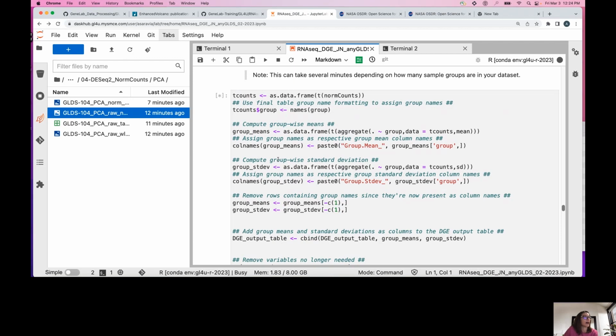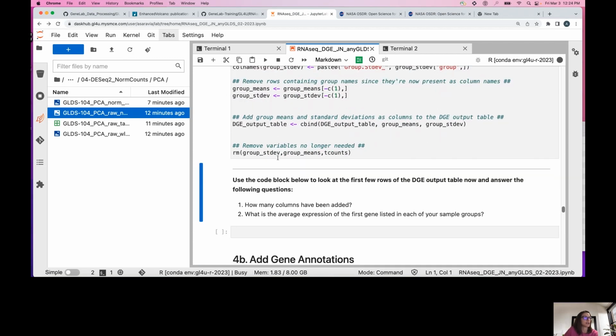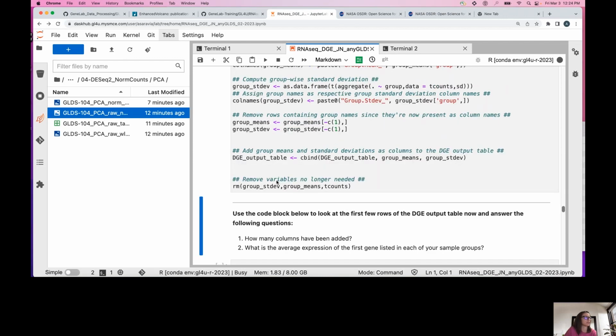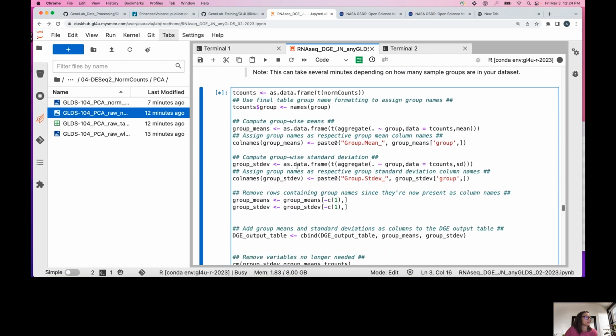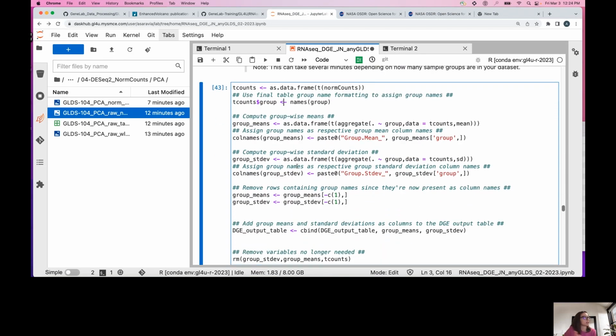It does look like, I know we have only about 6 minutes left. I'm probably going to need 10 or 15 more minutes just to be able to go through the GSEA plot. I don't have anything after this. Are you guys okay to stay on an extra 15 minutes? Yeah, 15 minutes is fine, but I have a class at 1. Okay, we'll definitely be done before 1. Sorry. No, that's perfectly fine. I always underestimate this time. It's because I'm a talker. But that's great. We love it. Are both of you done too? Are you still waiting? Yeah, it's finished.